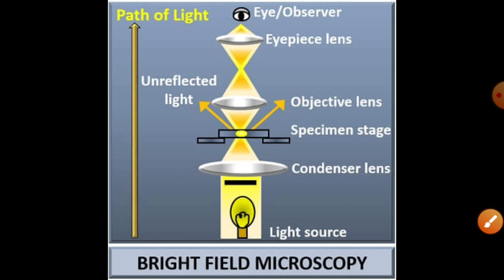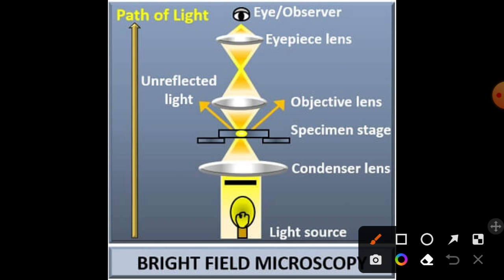Are you able to see what is in your field after the illumination? No. So that is what is going on in bright field microscopy. You will not see any black background; instead you will see a white background, with everything white. That means the brightness is so large that you cannot separate your sample from your background. So now what to do?